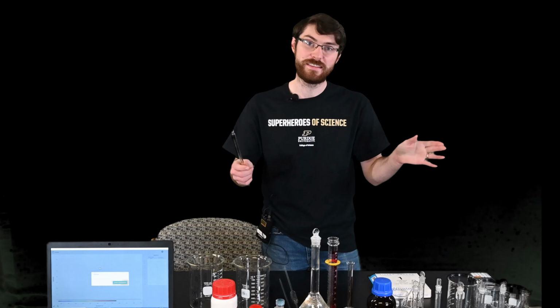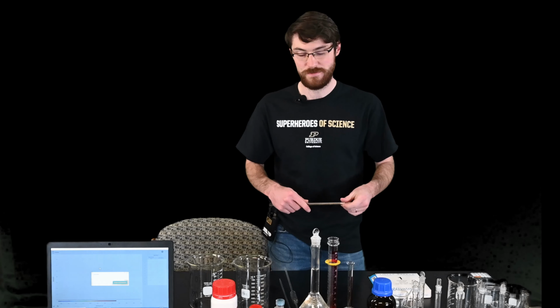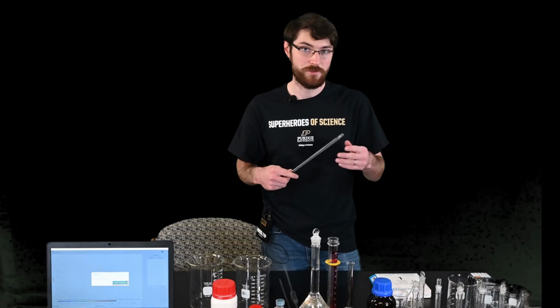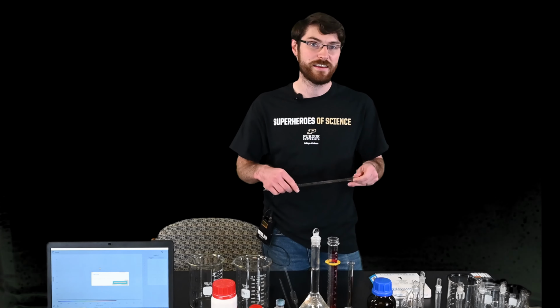So we're going to be using these then to deliver exact amounts of standard into our volumetric flasks, and that'll allow us to create a set of standards of various concentrations that we know. So that's the basic overview, and now we can get started making up our solutions.